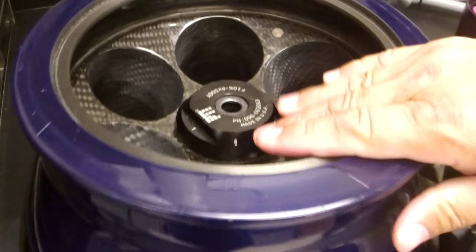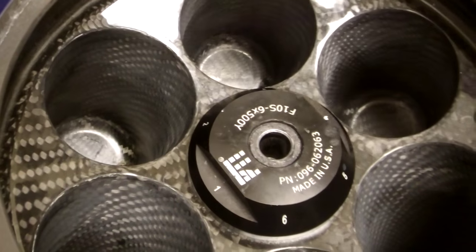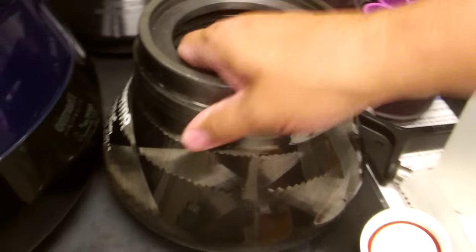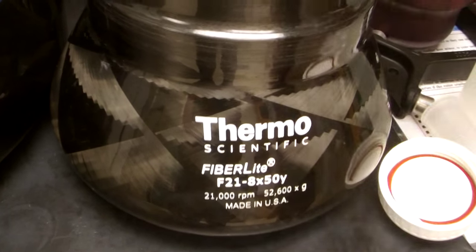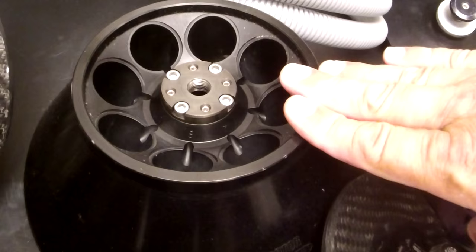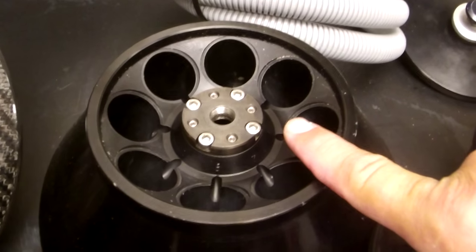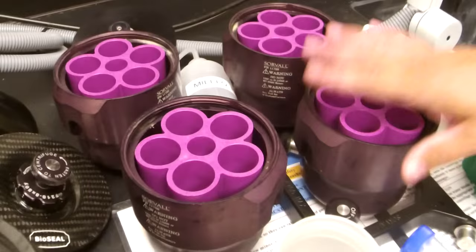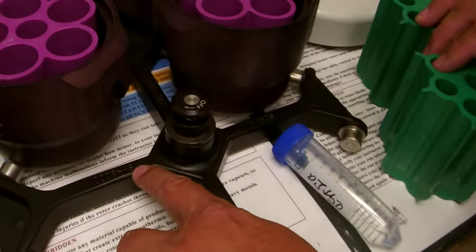We have a number of different rotors here to look at. Here we have a 500ml tube rotor, the Fibrolite F10 6x500Y, where there are six 500ml slots available. Here is another Fibrolite rotor, the Fibrolite F21 8x50Y. We also have a similar older metal version, the SS-34 head, which holds the same size tubes and works in both centrifuges. Over here we have the basic holder for a swinging bucket rotor and the four buckets for the Sorval SH-3000.